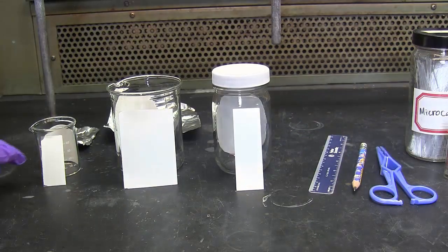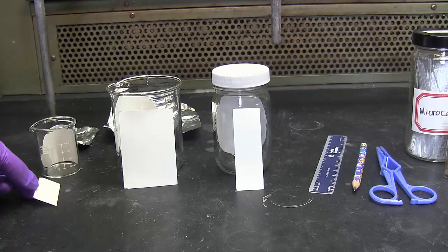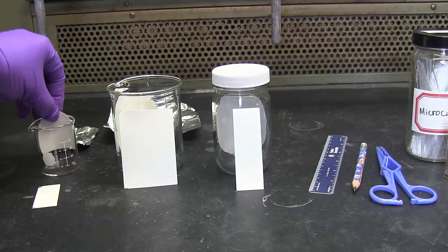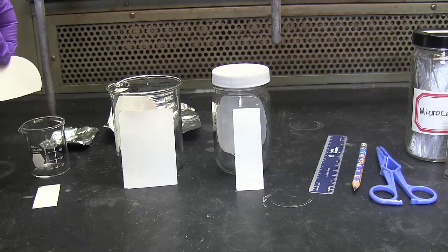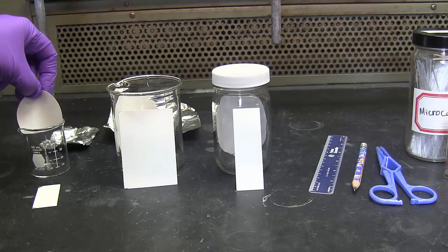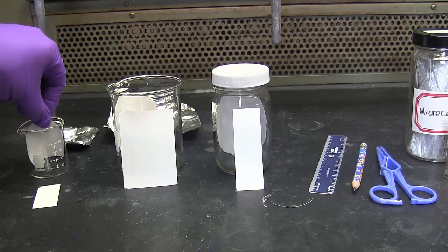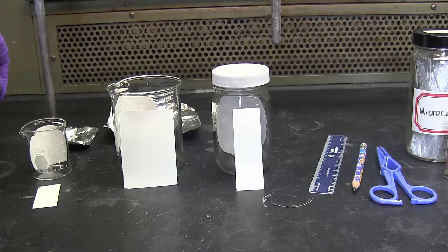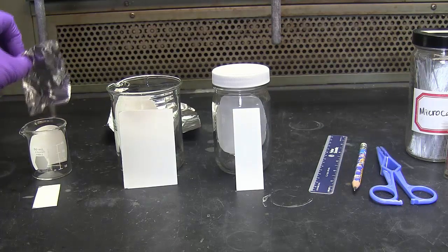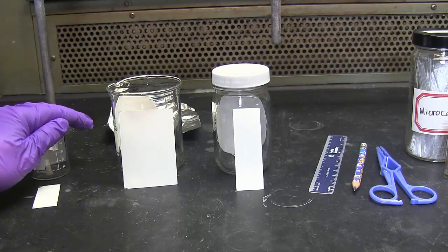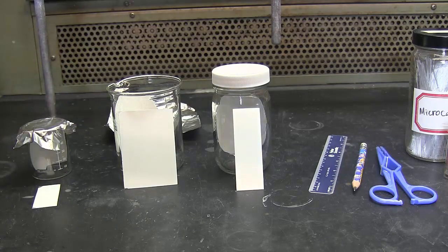To develop the TLC developing chamber, you'll need to have a piece of filter paper. You can cut one side and slide it down into the jar or beaker. Then you can cap it with aluminum foil, a watch glass, or if you have a jar, use the jar cap.